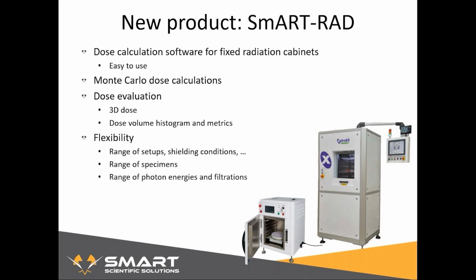It is intended to be used on a calibrated spectrum, but it can, at the cost of slight bit more uncertainty, still calculate dose outside of the calibrated range for the photon spectrum with internal scaling factors. So you can do virtual experiments if you're thinking about using a completely new spectrum. And very importantly, it can also export a dosimetry report, so you'll never have to fear that you forgot one of the advised parameters that NIST wants you to report.